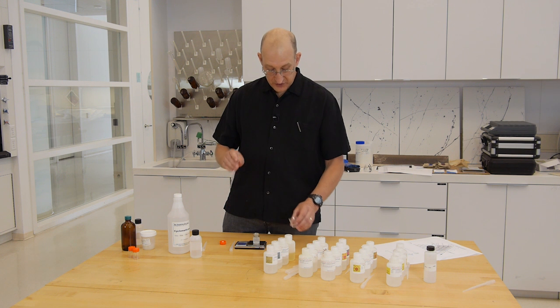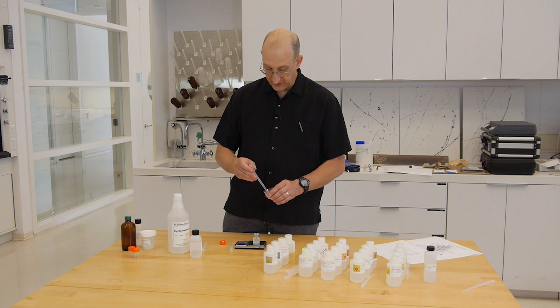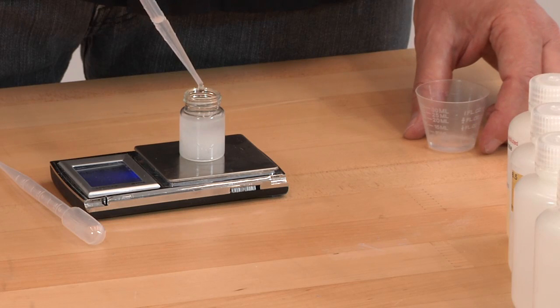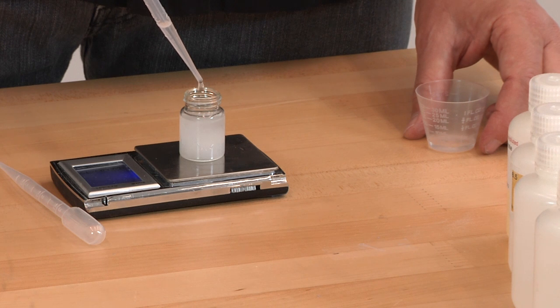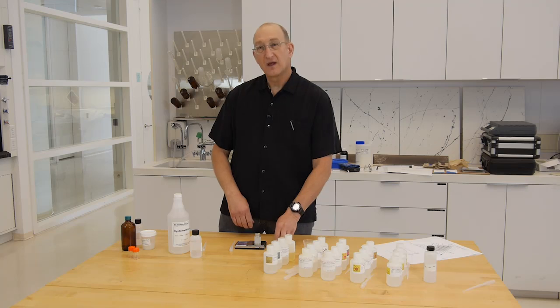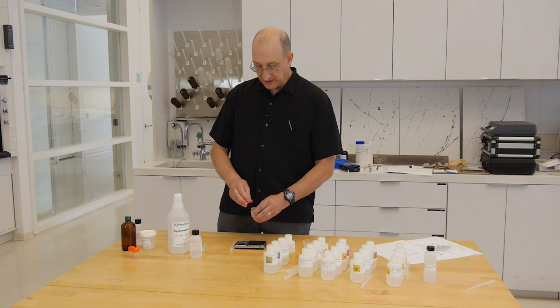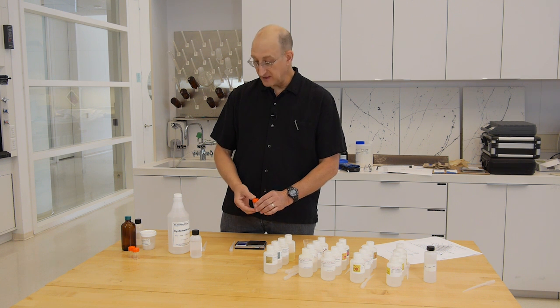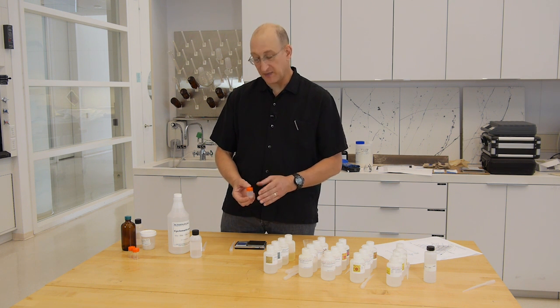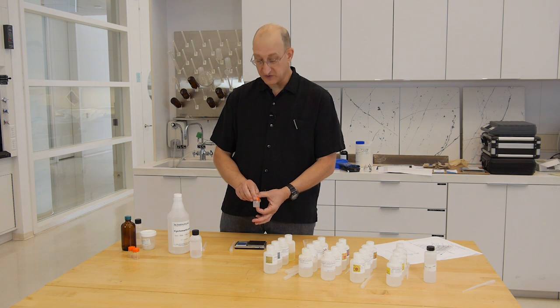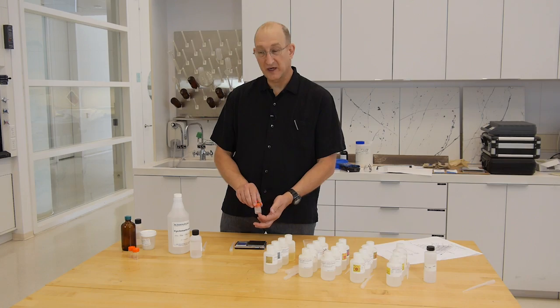Now we want to add 2.5 grams, 25%, 2.5 grams of the aqueous phase. Because this is a microemulsion, the energy of the aqueous phase and the energy of the cyclomethicone have been balanced by the choice of surfactant. So it takes very little agitation to make the microemulsion. So here we have our microemulsion.